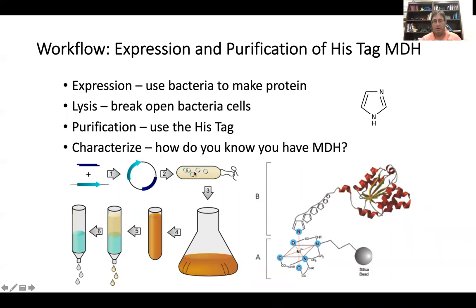You've already transformed it in. Now we're going to talk about growing from a single colony or a group of colonies in liquid culture, spinning them down, and lysing the cells.